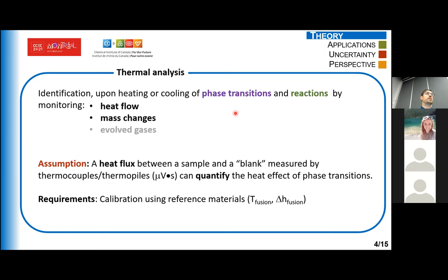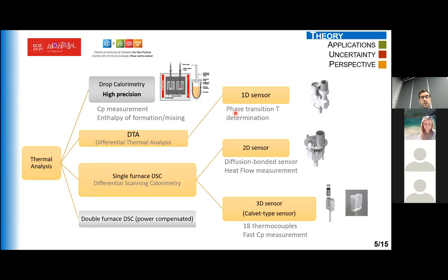So this is one of the key aspects of this technique. I'm trying to present here briefly a map of all the thermal analysis that I'm really focusing on in my research and that we can use in labs. I highlighted in gray the equipment that we'll not necessarily talk about today.